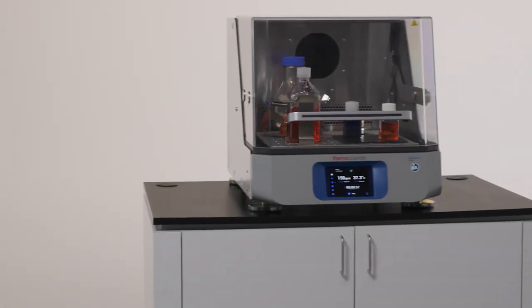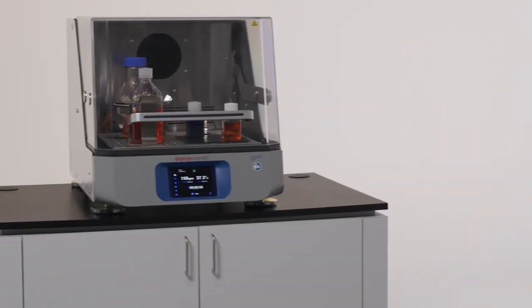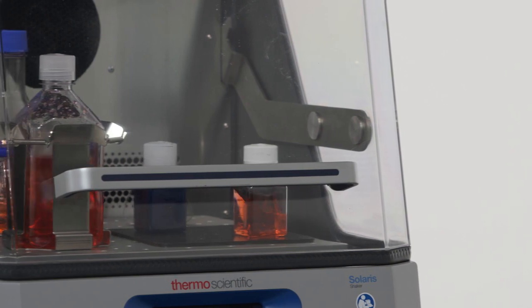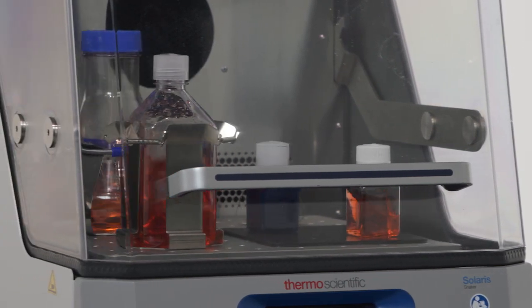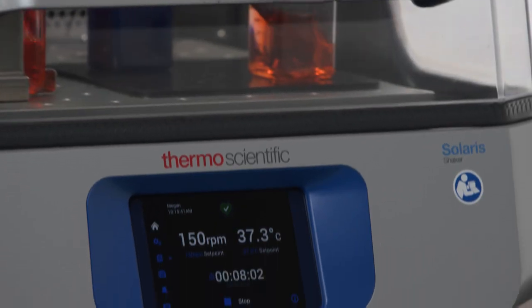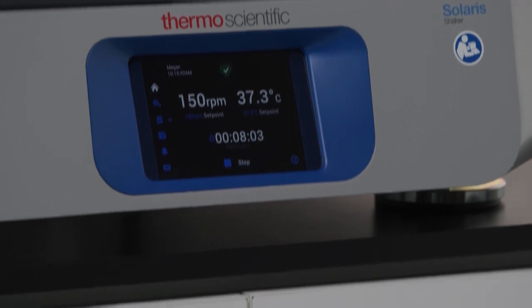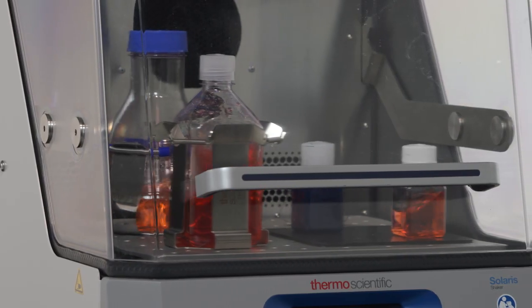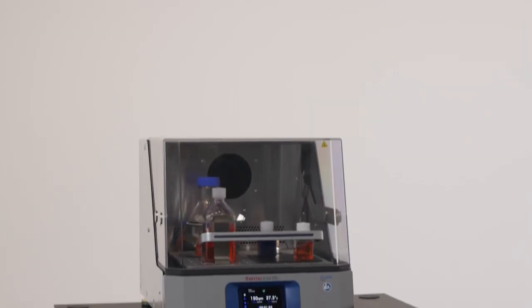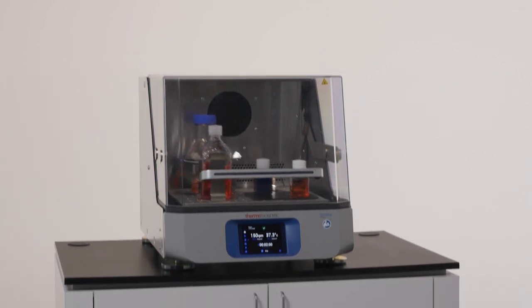The Thermoscientific Solaris temperature-controlled benchtop shaker family sets a new standard for reliability and technical innovation. From the programmable touchscreen display to the heavy-duty drive system, these benchtop shakers provide reproducible and consistent performance to move your science forward.